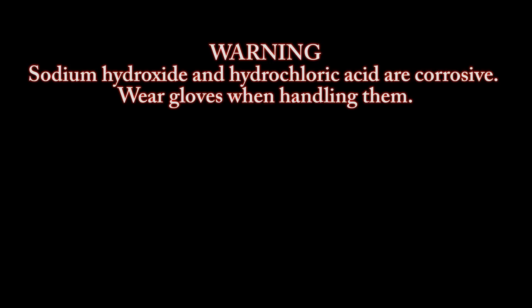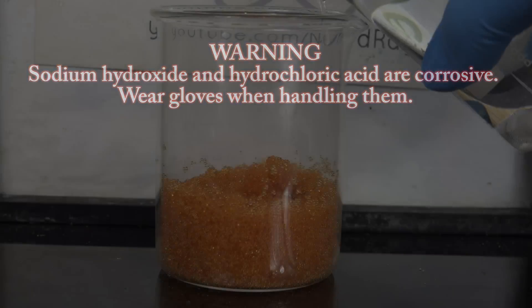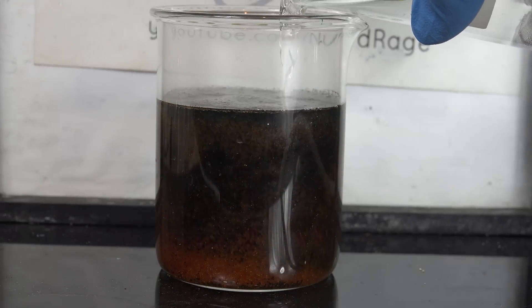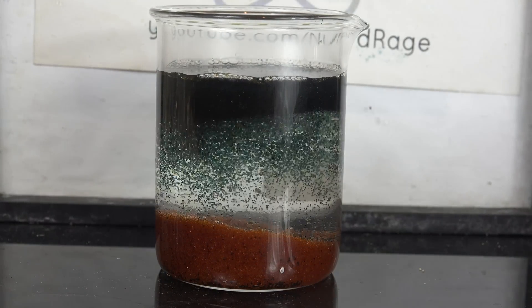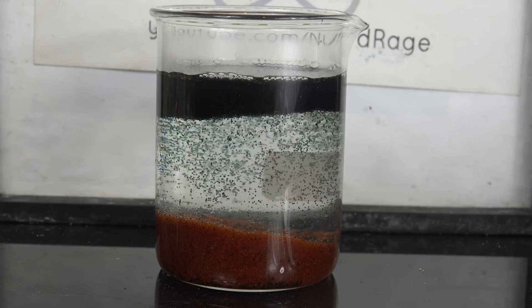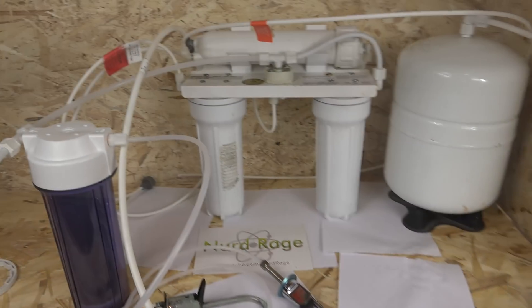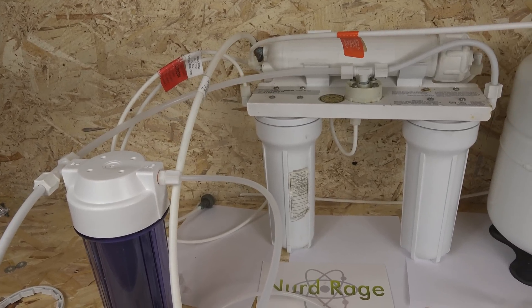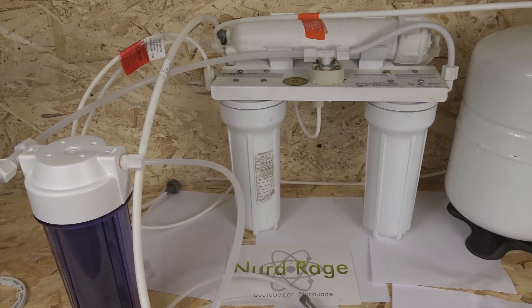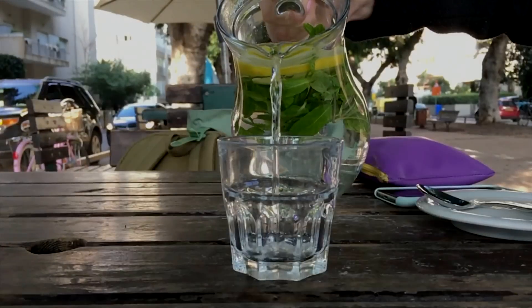Warning: sodium hydroxide and hydrochloric acid are corrosive — wear gloves when handling them. Greetings fellow nerds. In this video we are going to regenerate depleted deionization resin so it can be used again in reverse osmosis deionization systems. If you're like me, you're using a reverse osmosis deionization system to produce purified water low in minerals for your amateur chemistry experiments. Alternatively, you might be one of those weird people that actually drink water.